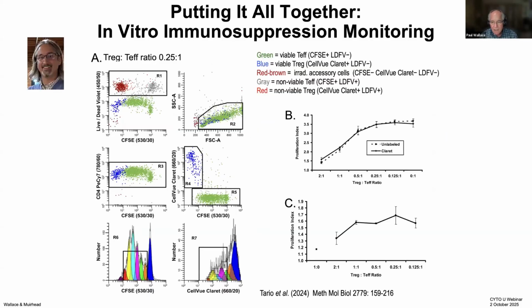Another example of an assay that you can do here is looking at the inhibition by regulatory T cells of T effector cells. Regulatory CD4 T cells down-modulate immune responses and are functionally defined by their ability to suppress the proliferation of CD4 T effector cells. Flow cytometric suppression assays in which T effectors are labeled with a proliferation dye have increasingly replaced tritiated thymidine assays, but in the flow assay, it can be difficult to distinguish between dim, highly divided T effectors and unlabeled Tregs, since both populations express similar levels of CD4.